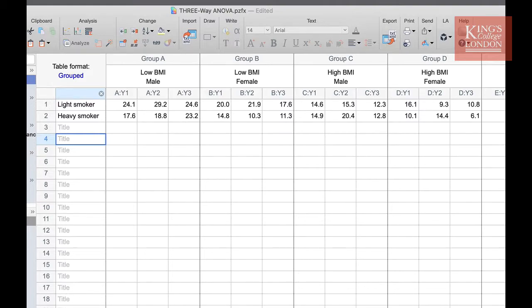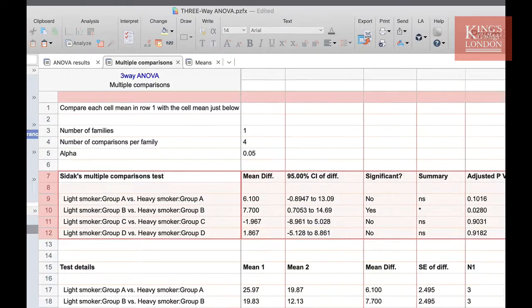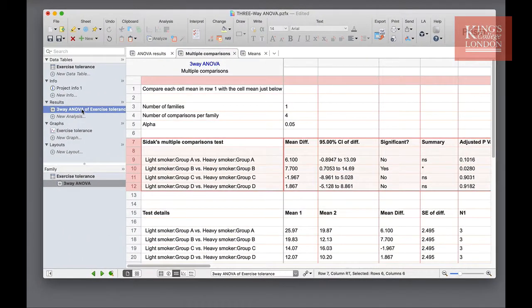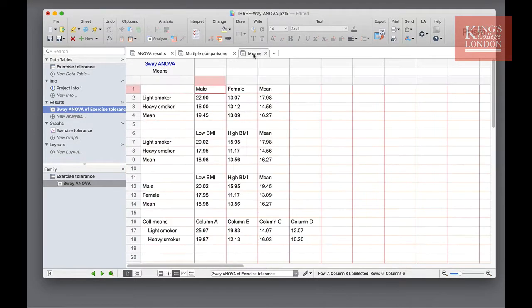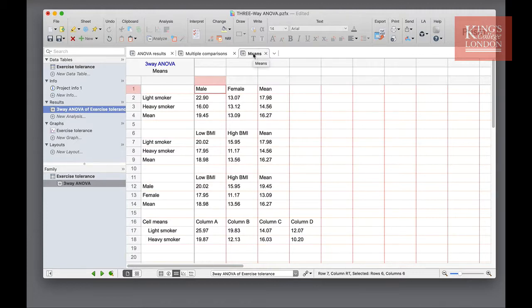So back to our results table. The final tab within the results table is our means comparison tab. This allows us to look at the means of all the data sets. So if you're creating a table to show in a report, this gives you a quick glance at all of the means. This table reports the means of all rows, all groups, and all columns.